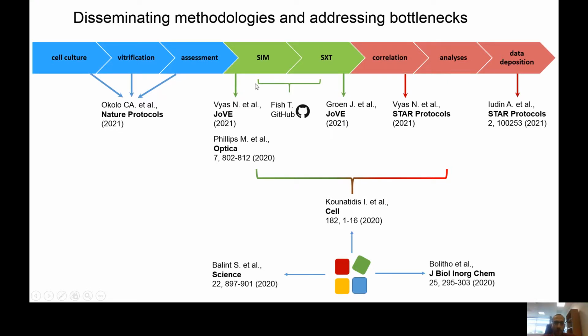We have a JoVE paper here describing the steps for collecting data in SIM. The Optica paper here describes the technical specifications of the microscope. Another JoVE paper describes the data collection on the X-ray microscope. And we also have the GitHub releases by our software scientist, data analysis scientist, Tom Fish, of different software that he developed for automated data collection and reconstruction.